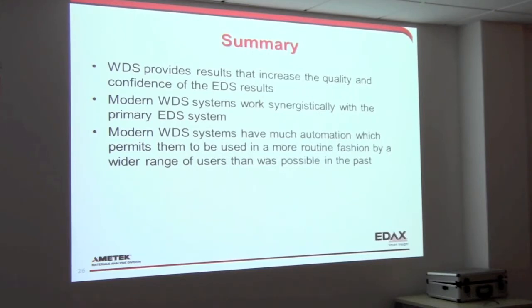They are all focused in X and Y, so you have to go to a magnification of 1,000 to 1,500 because they are spatially focused. With the EDAX systems, the LEX and the TEX, think of them as a parabolic reflector that focuses to a spot in space that is energy dependent. So at copper K alpha, it's approximately 50 microns in space. You have to put your sample to within 50 microns. That's why we vary the Z on the stage to get to that 50 micron location. By the same token, it's 50 microns laterally. So that's where all the intensity is, and you need a high enough magnification to distribute that. Carbon, of course, is a larger spot, so you can go down to about 200 magnification for that.